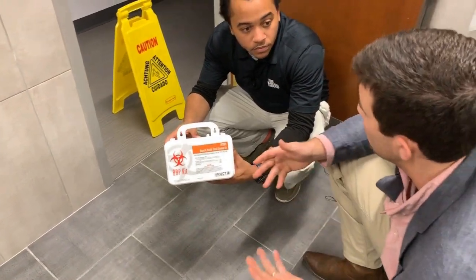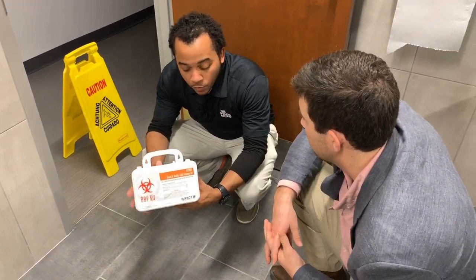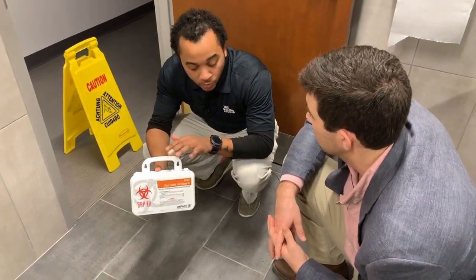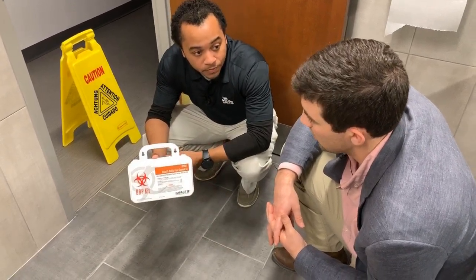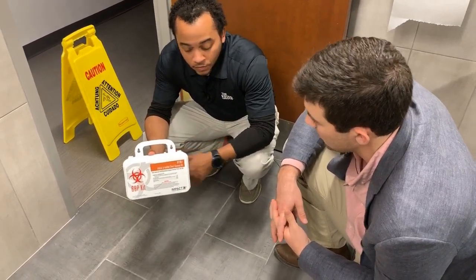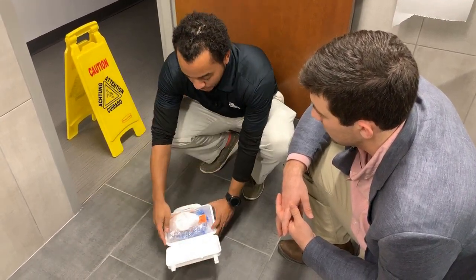All right, Dennis, what are we doing on the floor? Well, first off, we want to make sure we're a good distance away, so that we don't get any contaminant on the PPE. What's in this box, because right now it's sterile. Okay. All right. So let's get in there and show me how to use this thing. Yeah. Let me break open this kit and show you the supplies that are in here.